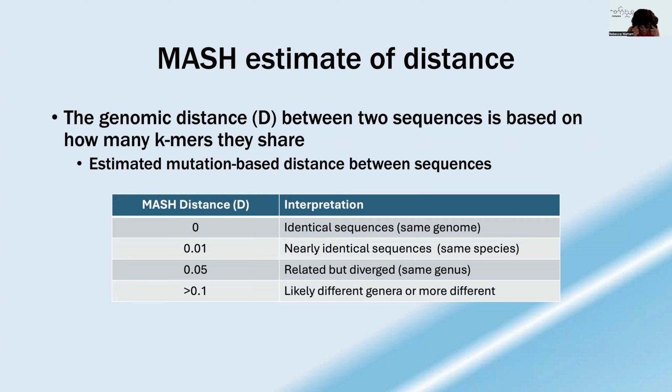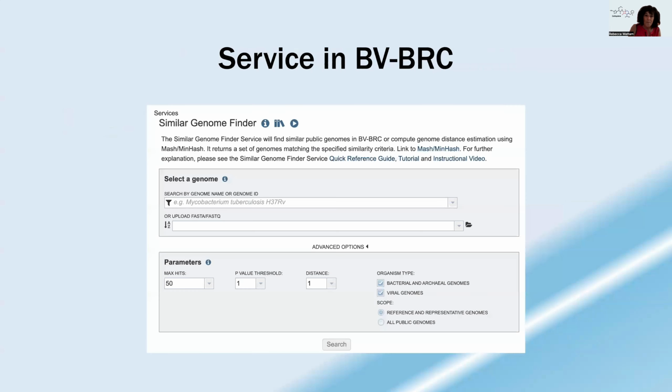Now, keep in mind that these are k-mers. It's not the whole sequence. So even if you have something that's 0 distance, because it's looking at small areas of the genome, you can't just say, oh, these are identical, it's the same genome. They're close, but there may be a lot of differences that we're not seeing. So you need to look a little deeper.